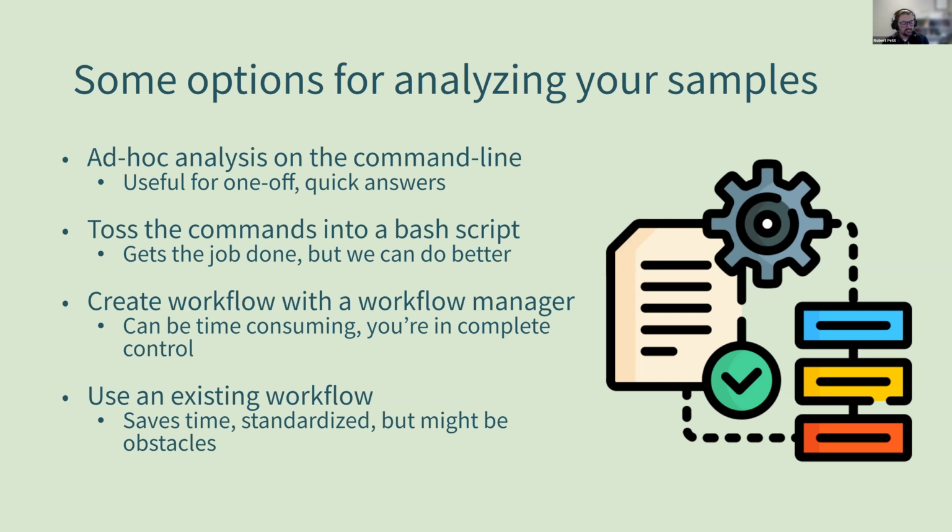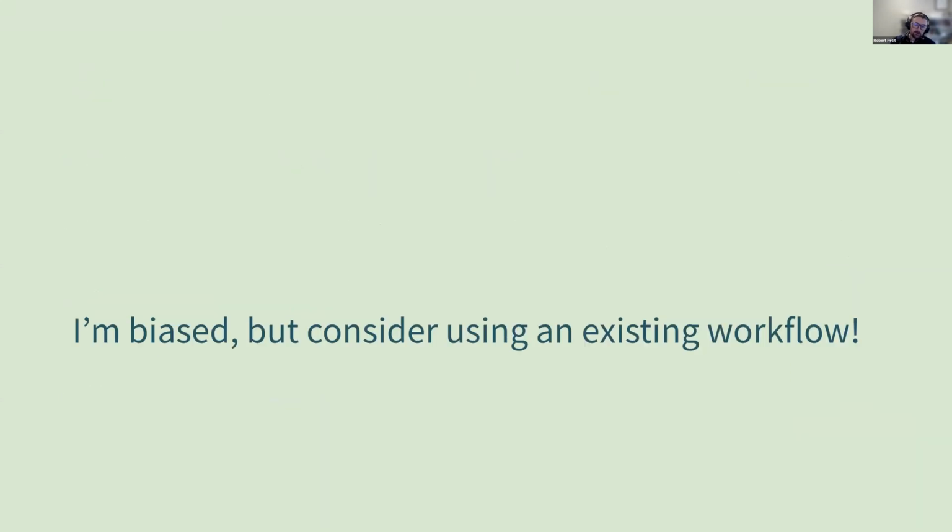We've mentioned it a few times today, that whole 'it works on my system' problem, and containerization helps get around that, but there's still that initial setup that can be troublesome. So there's all sorts of things to keep in mind, and many ways to analyze your samples. But I'm a bit biased, so I hope to try and persuade you to consider using existing workflows.